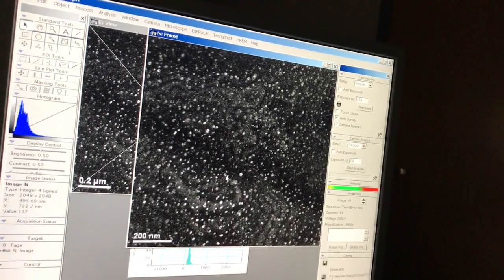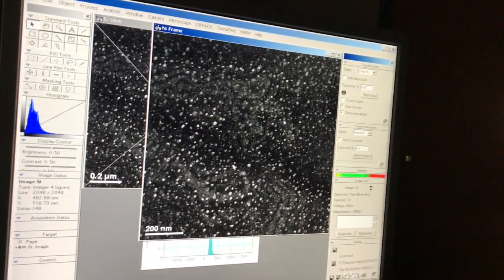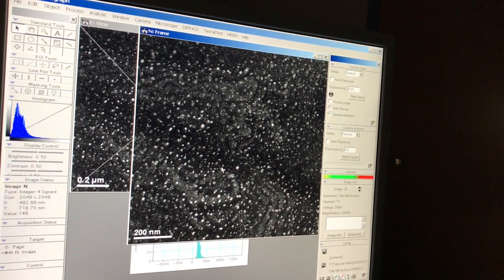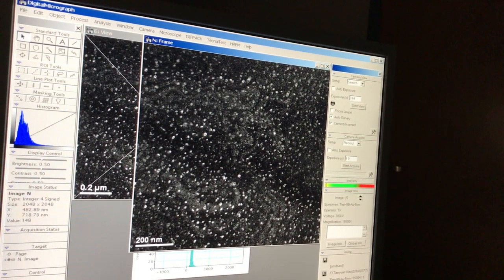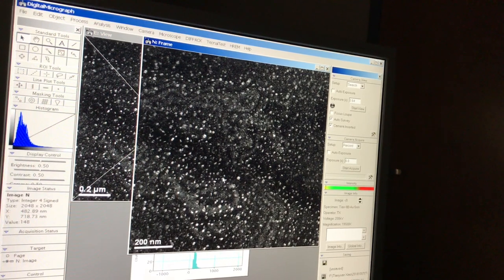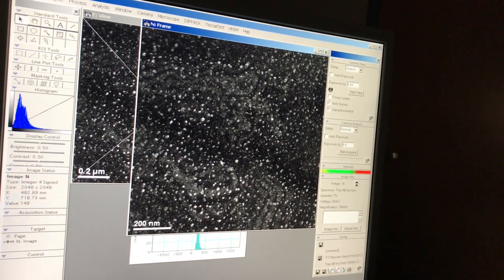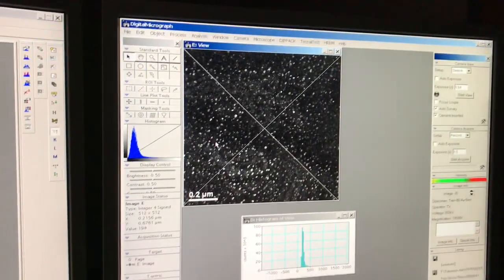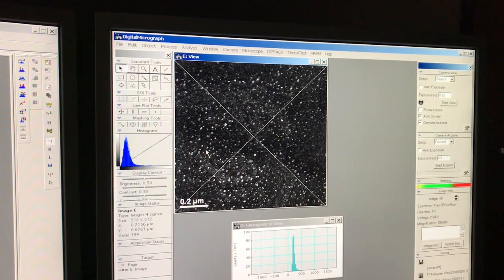And that's the bright field with the positive S. Again, we still get sharper contrast here with the weak beam. So this is accepted as usually the best method of getting sharp contrast when you're imaging faults. I'm going to decrease my exposure time here for a second.